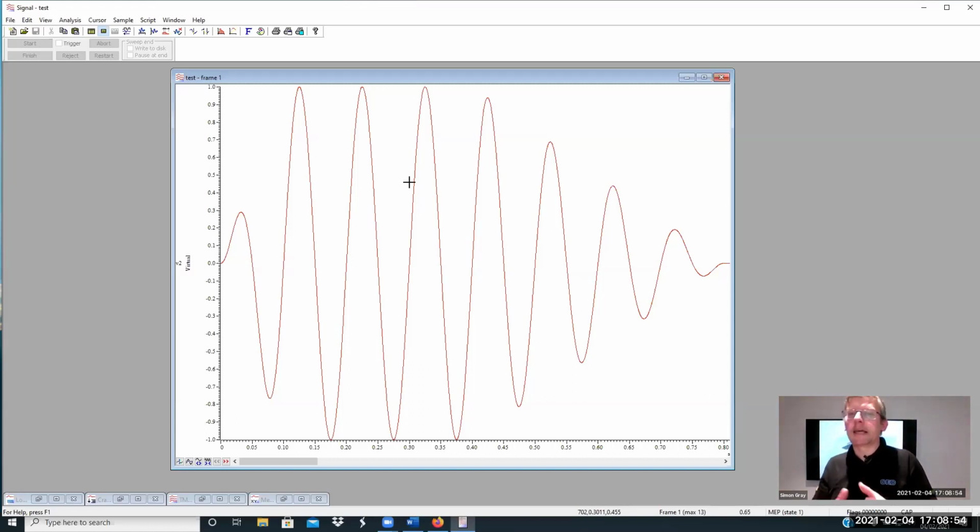But with TMS, we tend to want to head towards what's called a clamp. So we have them fitted to some of our 1902s, and that means that we signal to the clamping circuit on the amplifier, moments before the stimulus is applied, and it clamps. It effectively holds the input at a known level. The stimulus then happens. We're still holding that level, and then we release it a few moments after the stimulus has disappeared. I mean, we're talking milliseconds.